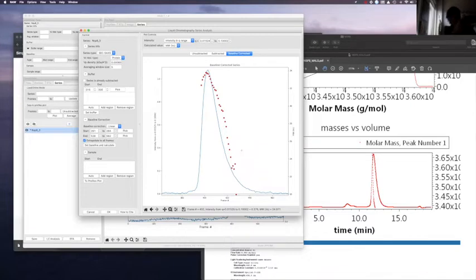This changing radius of gyration is also reflecting a different oligomerization state, because you see the molecular weight change from 34, which is what we see in the molecular weight, to almost 22. You remember I told you this NSP8 in the monomeric state is 22 kilodaltons. So it seems like only the last tail of the elution has mostly the monomeric state, versus here it's something in between monomer and dimer. So already from this information you get an idea of how the sample behaves.